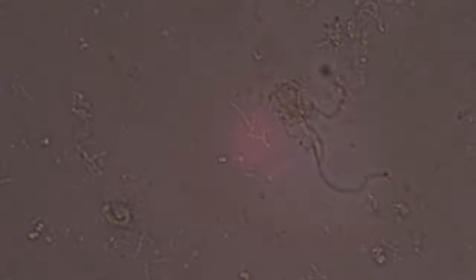So that's pretty cool. Lots of bacteria, all different bits of it. Not finding anything else other than that. Luckily, I'm not finding any protozoans in my sputum, as they call it. Lots of bacteria, though. And it makes sense, too, because several days ago, I had yellow phlegm coming out, which is, you know, your body fighting off some real infection.